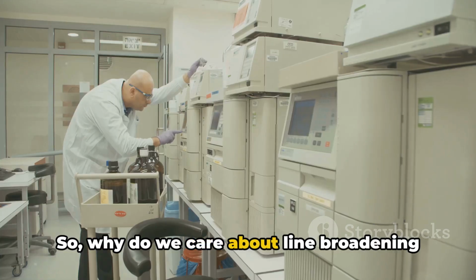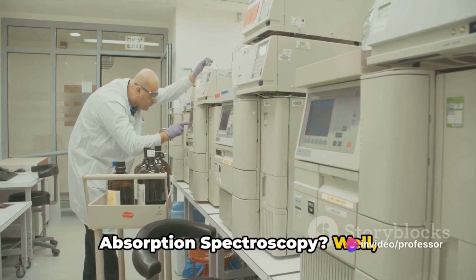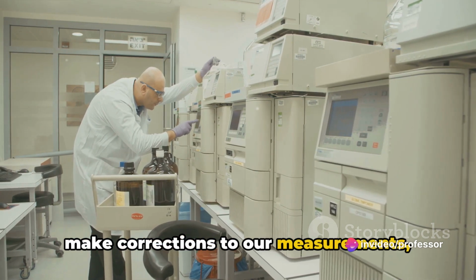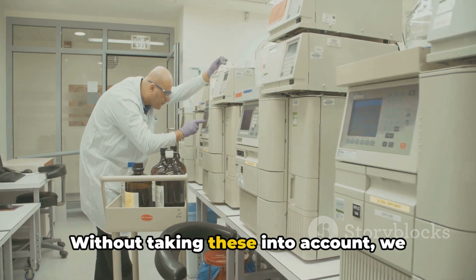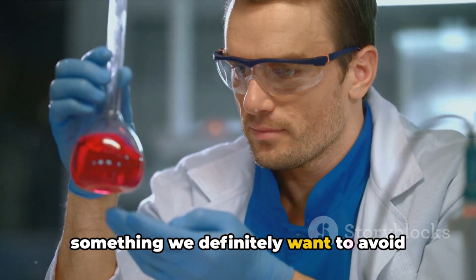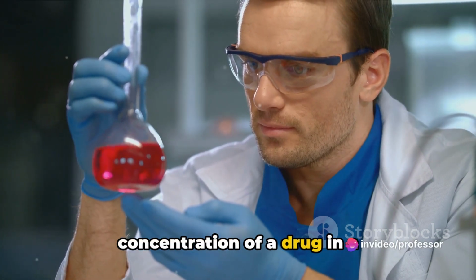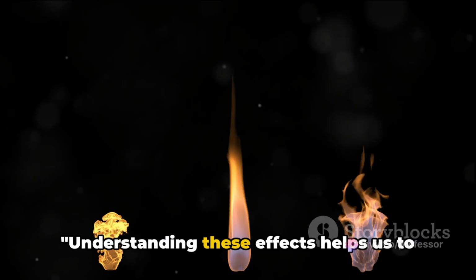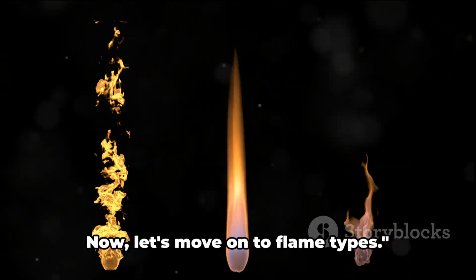So why do we care about line broadening and the Doppler effect in atomic absorption spectroscopy? Well, understanding these effects allows us to make corrections to our measurements, ensuring we get accurate results. Without taking these into account, we might misinterpret our data, which is something we definitely want to avoid when, for example, determining the concentration of a drug in a pharmaceutical product. Understanding these effects helps us to interpret the results of AAS accurately.